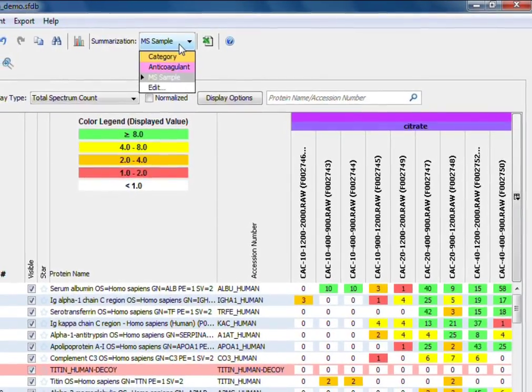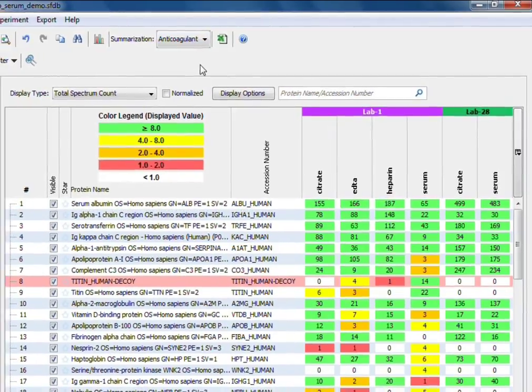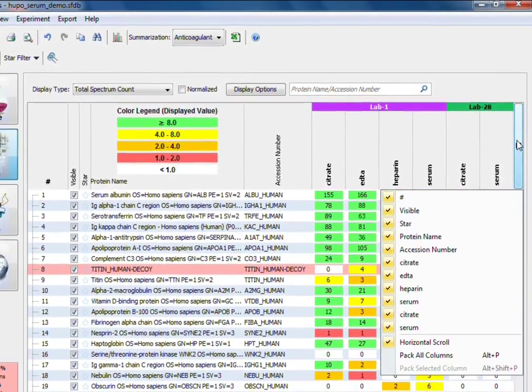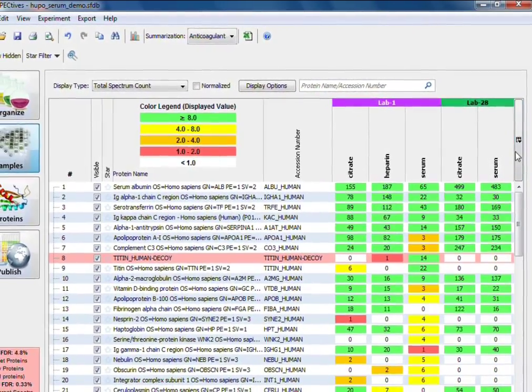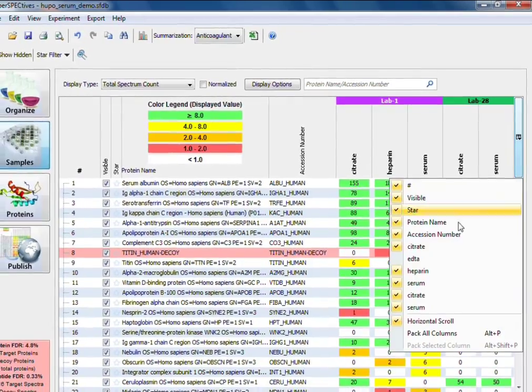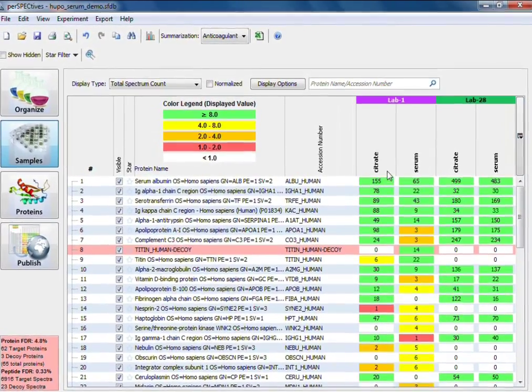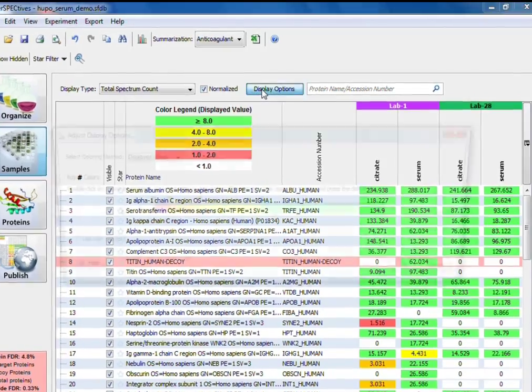With perspectives, you have the flexibility to build your experiment as necessary in multiple views. The samples view shows you the selected values for each protein, depending on the summarization structure that you create.